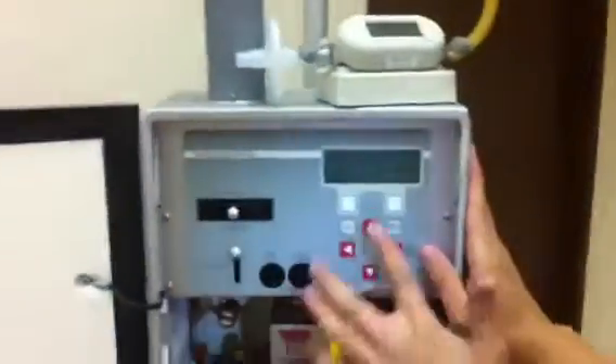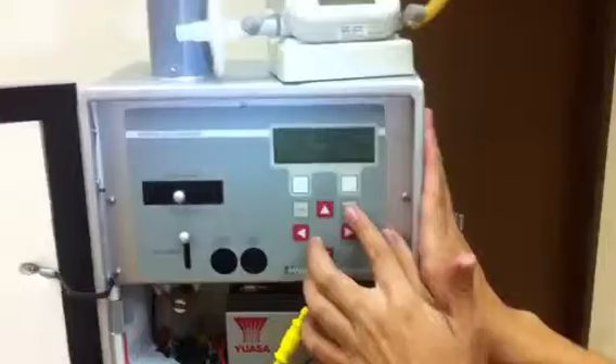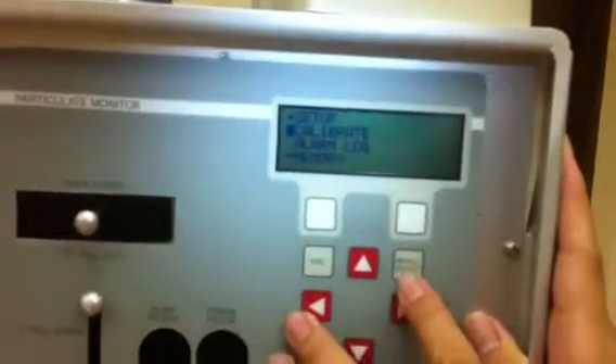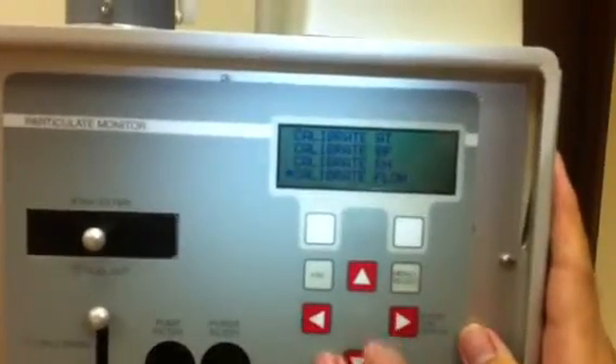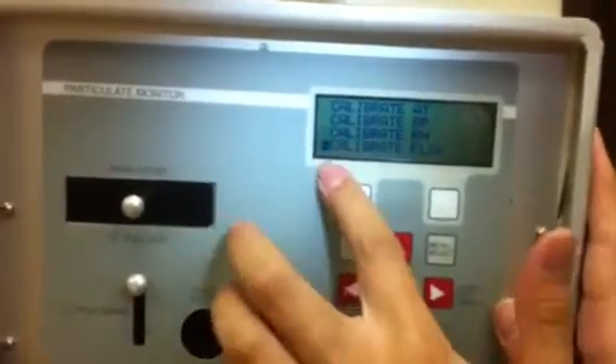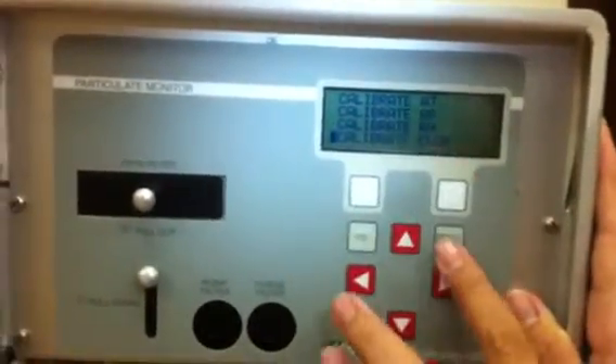Now we are going to select the calibration. Go to the menu and select the calibrator. Then we press select and we choose the calibrate flow, and press select.